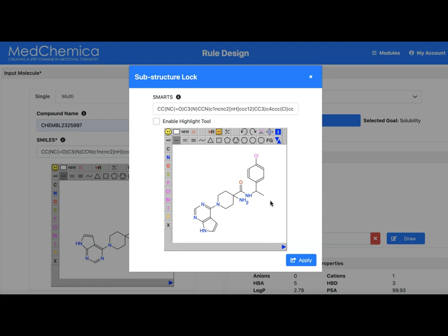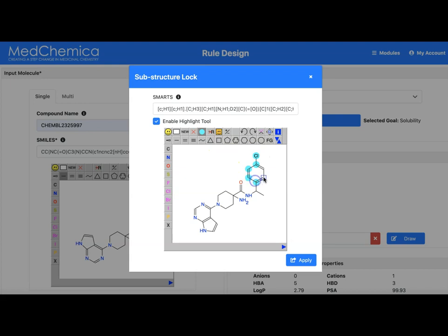We need to lock out the part of the molecule that we don't want to change. We have a helper tool here to help us do this. We enable the highlight tool and highlight the bits of the molecule that we want to change simply by clicking the atoms we are wanting to change. We don't have a lasso; we have this highlighting tool instead, which is quick and precise to use unlike sometimes the lasso tool.